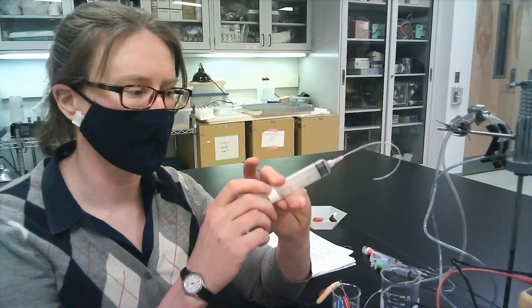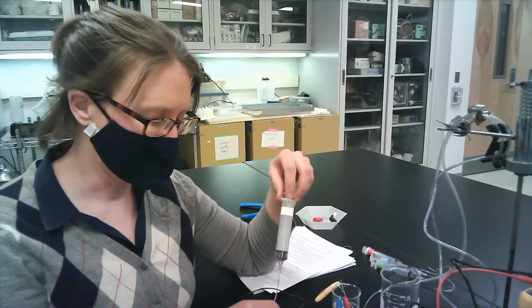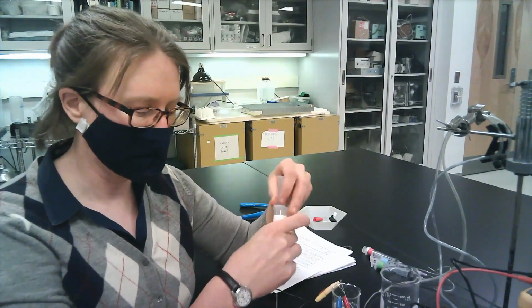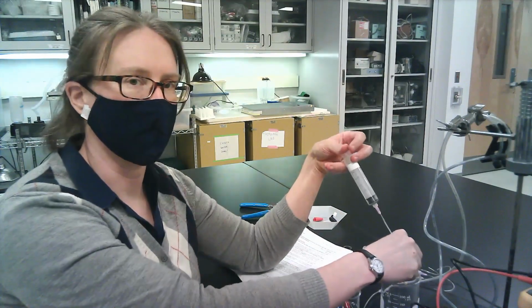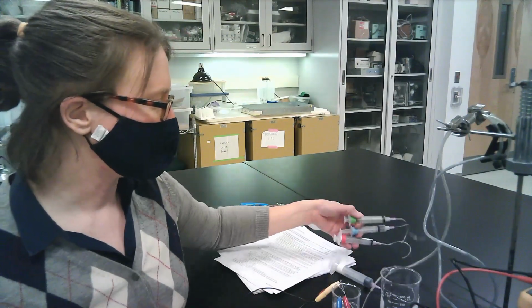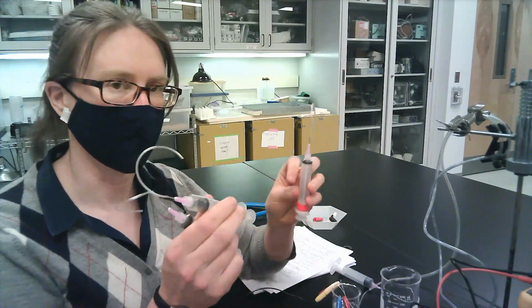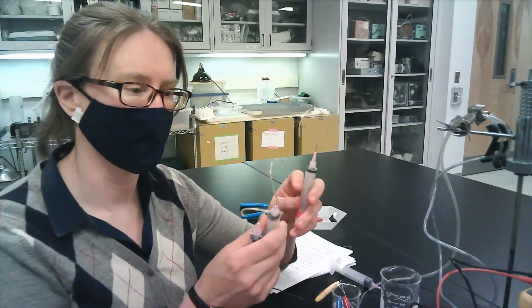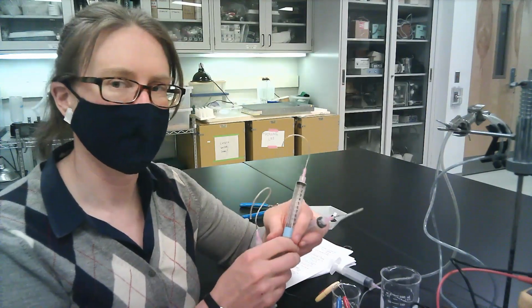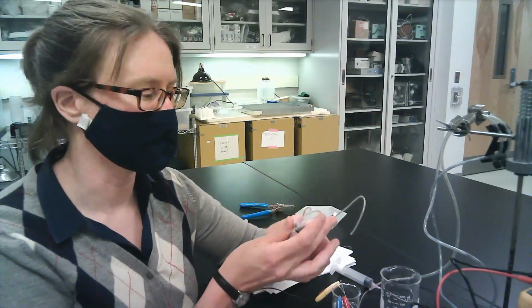The biggest syringe here with the white tape on it is for discarding saline solution. So you just want to put that piece of tubing into each side of the chamber, draw up solution, and then discard into a discard beaker. And then depending on what solution you are adding, there are syringes that are color-coded for adding various different solutions across the different experiments. Notice, for doing that, you're going to want to add specific volumes, so pay attention to the volumes that you're injecting with the syringes.